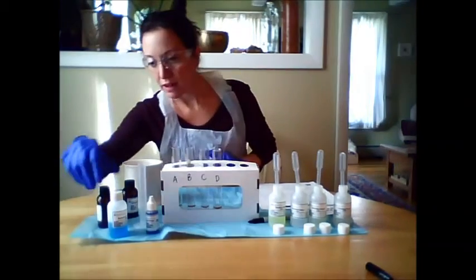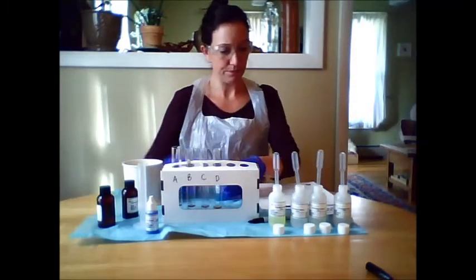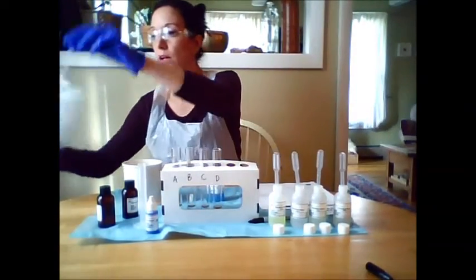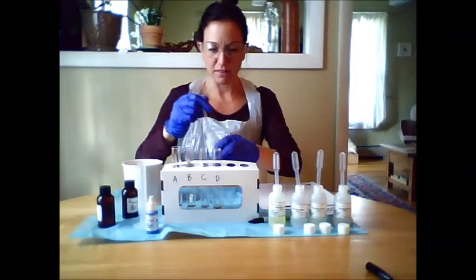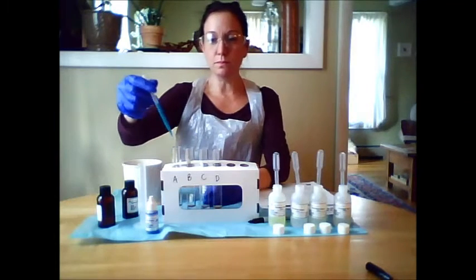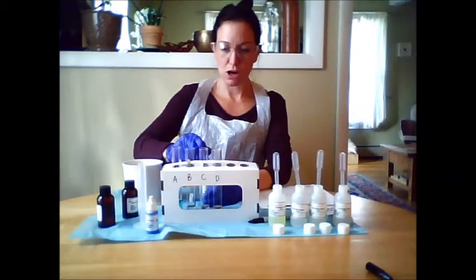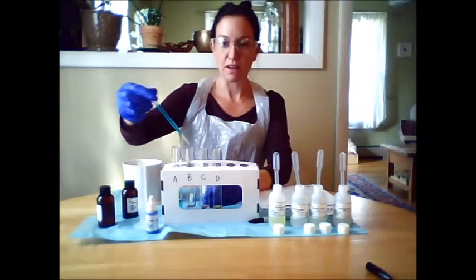So, for the next part of the experiment, we'll be adding the Benedict's solution. And with a new pipette, I will add 3 milliliters of Benedict's to each test tube. These pipettes are graduated, and that means they have markings on the side.